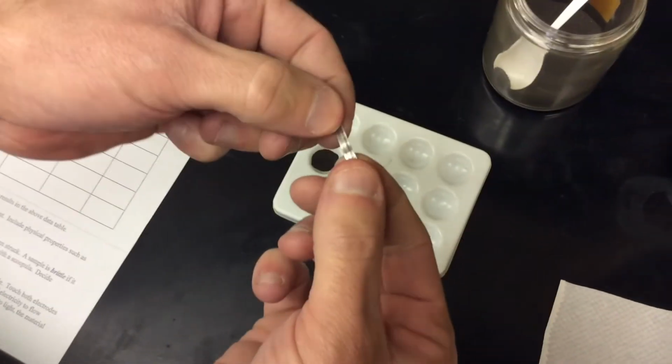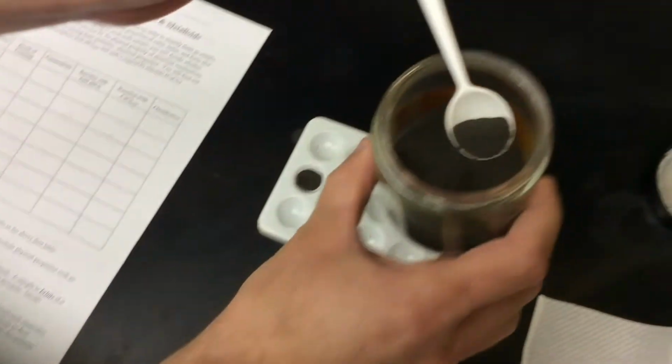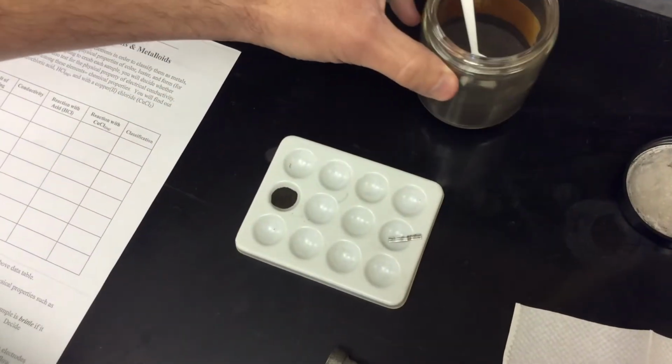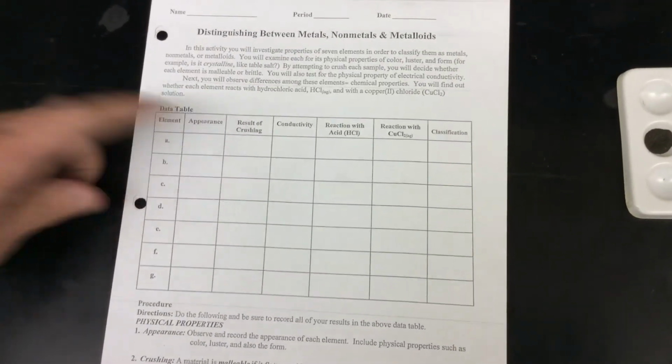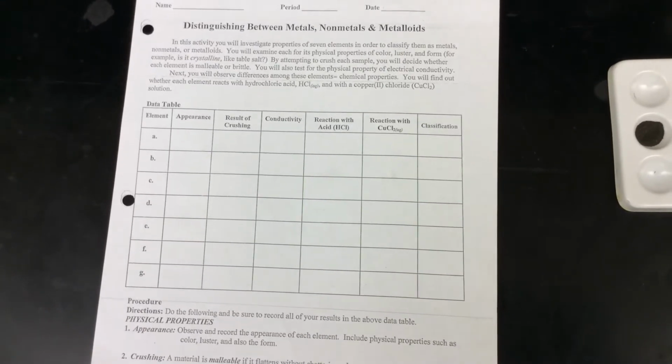So you have something like this compared to something that might be more like this. So whether you want to use the word powder or crystalline or however you want to do it, you want to classify those things according to appearance. The next column is result of crushing. You really only have 2 words to choose from there. You have brittle or malleable.